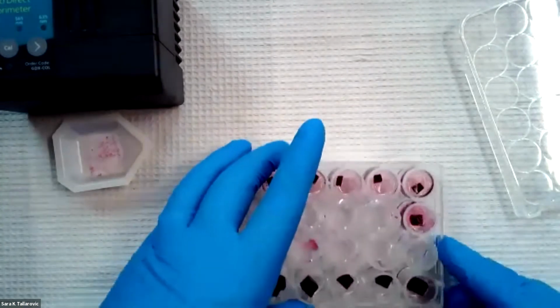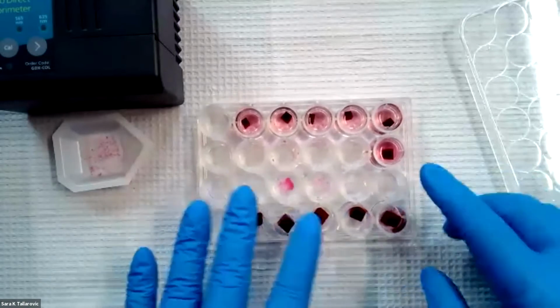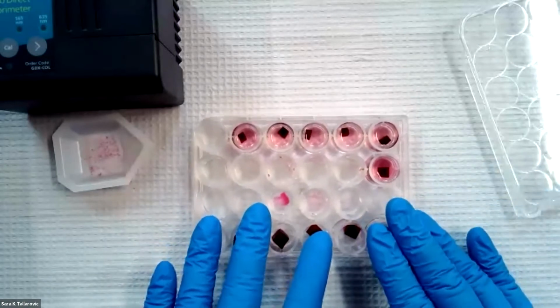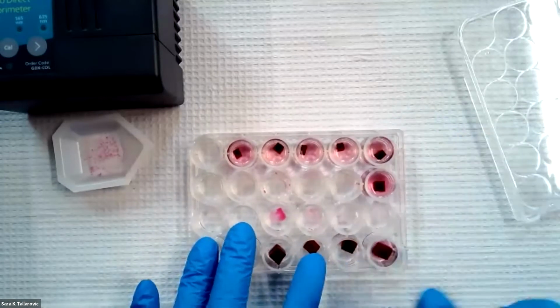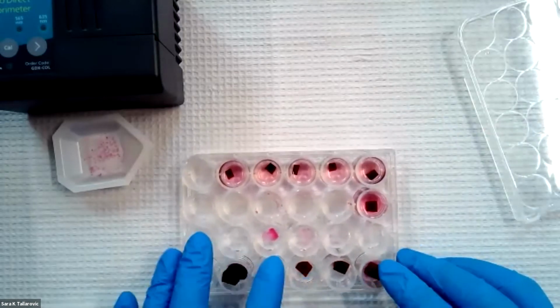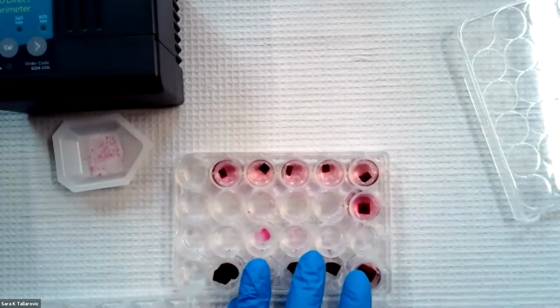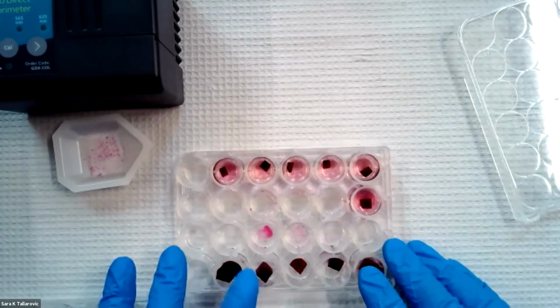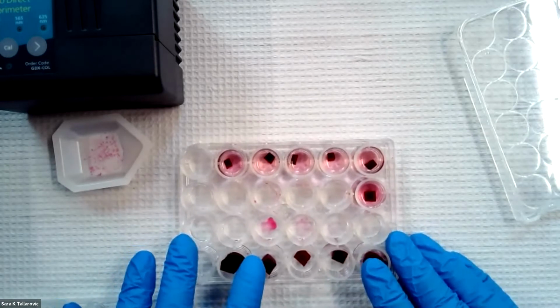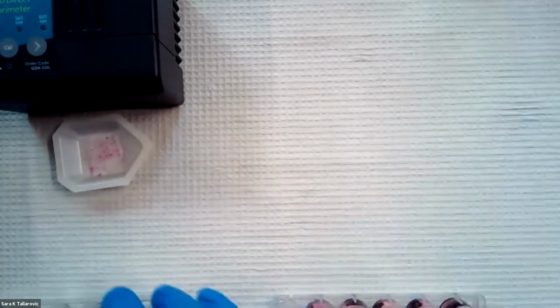Some micro well plates are a little easier to label than others. I find that I just have to remember where this is one of the ones that the wells don't have a surface next to them that you can write on easily. But you incubate your samples in your solutions. I'm starting, by the way, with a salt solution that ranges from 0% sodium chloride to 15% sodium chloride. And you can see that these have been incubating for about 10 minutes, and you can see the color has already changed in our samples.